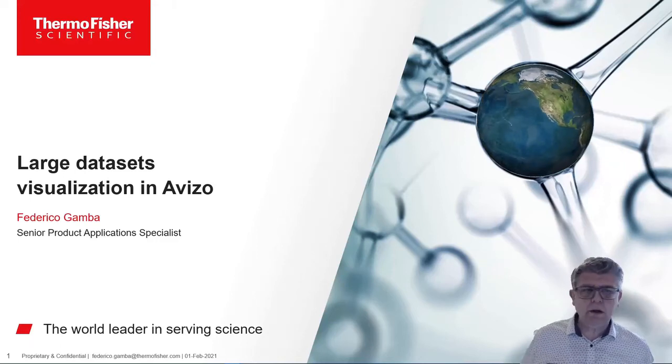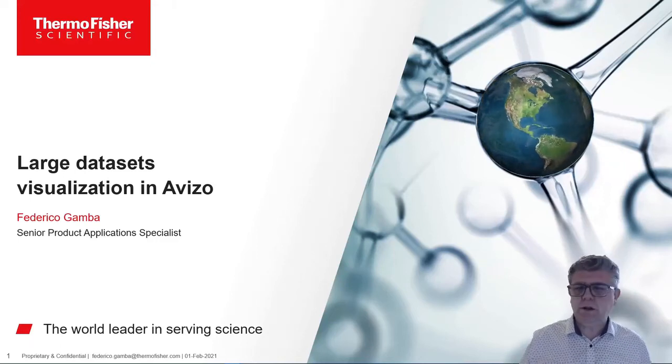So welcome to this tutorial about large dataset visualization in Avizo.